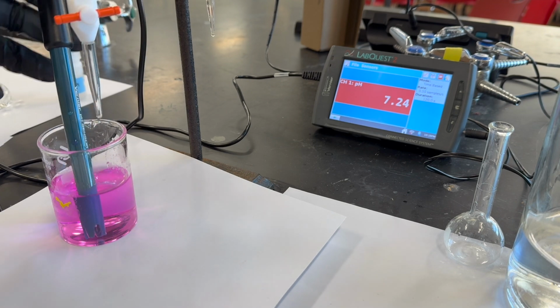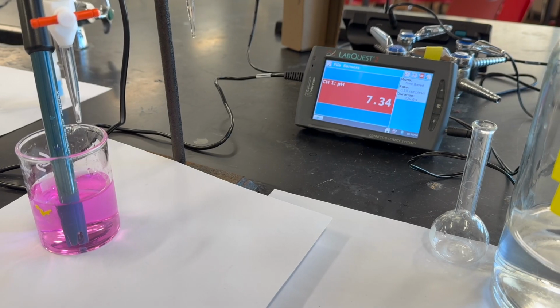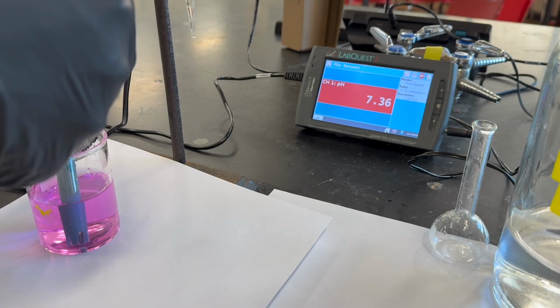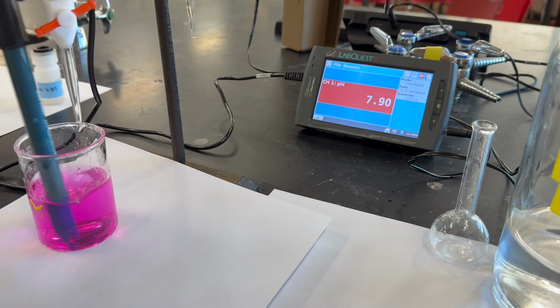At a pH after 25 milliliters, we are reaching the equivalence point, and we will continue half milliliter increments until we get to a pH of 9.